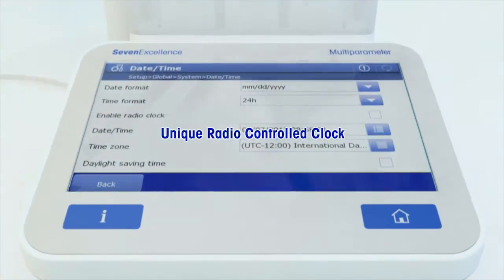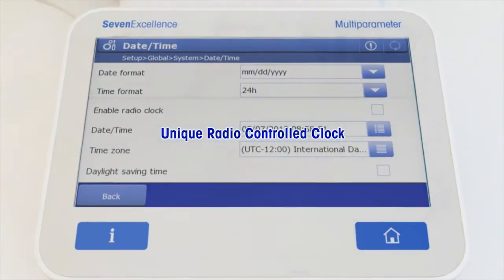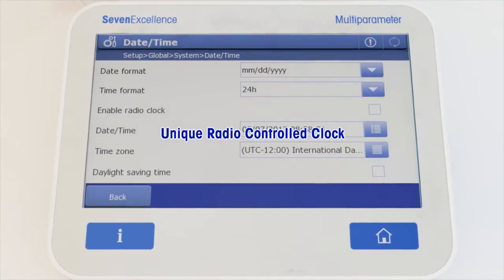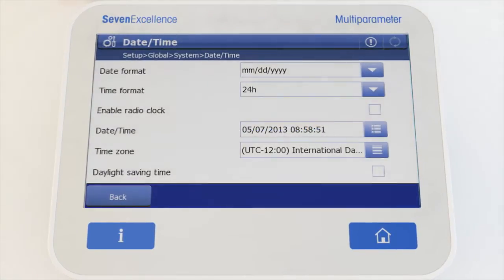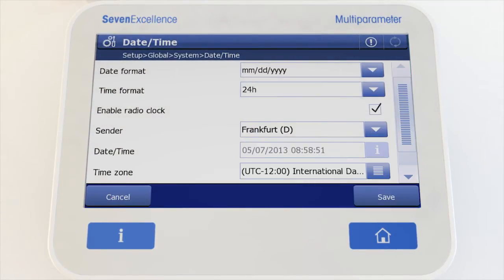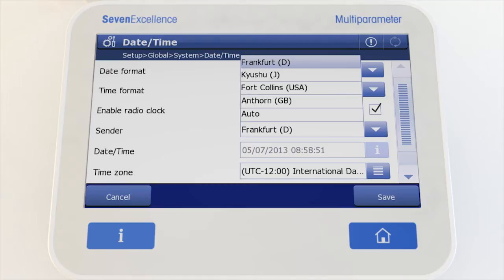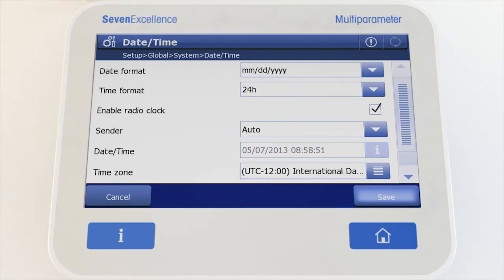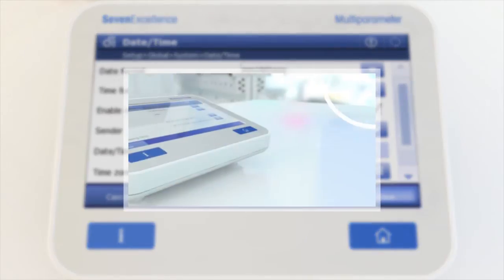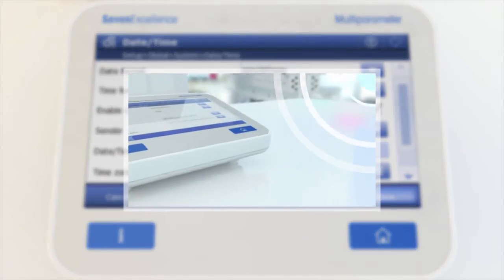An integrated radio-controlled clock guarantees correct date and time with every result, thus impeding any falsification of data. Security, every minute of every hour, only with 7-Excellence.